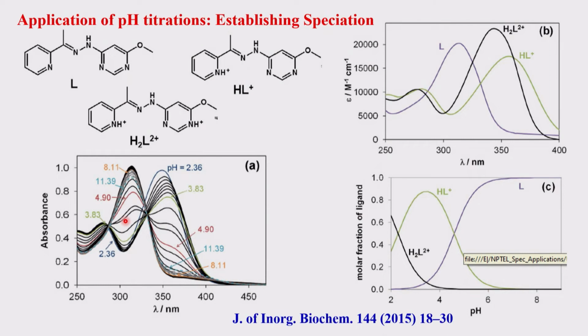So obviously their absorption band positions and intensities will vary. So as you keep varying the spectra, you can see that things are going in this direction, things going in that direction, etc., as I have explained earlier. So at different values of pH. For example, at an acidic pH, there is a very high value at this 350, 360.